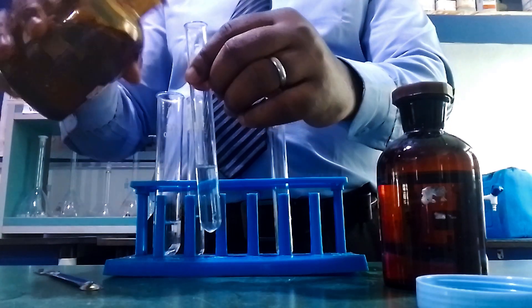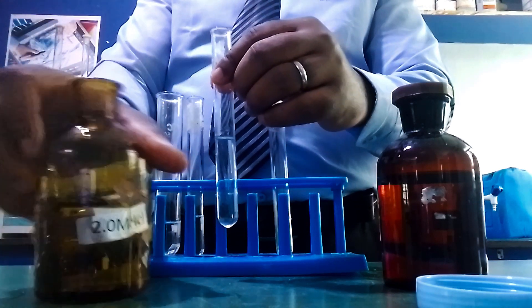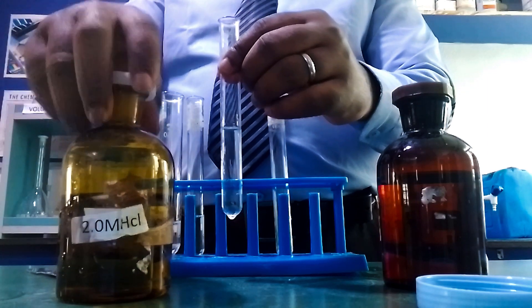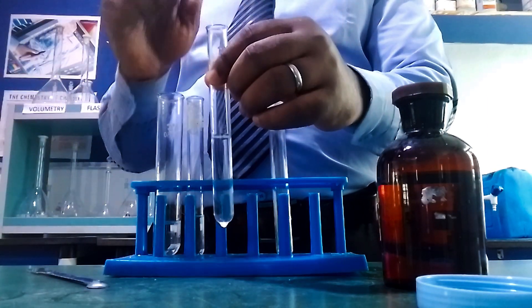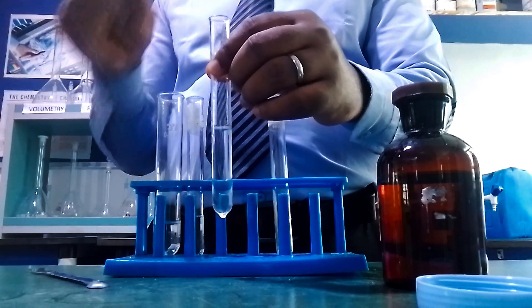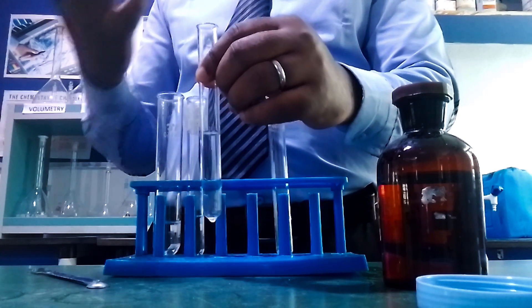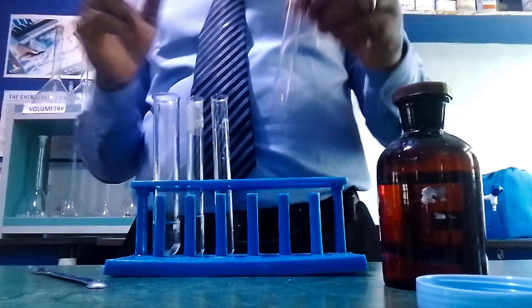You can see the precipitate dissolves when we add excess hydrochloric acid, which means this is either CO₃²⁻, SO₃²⁻, or S²⁻. But since the gas is odorless, it can only be CO₃²⁻. Now let's confirm.